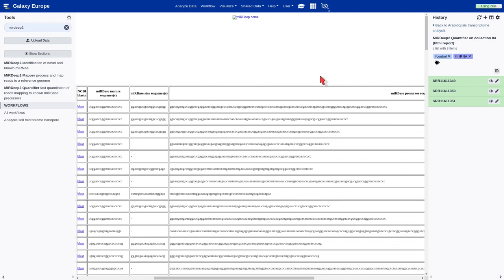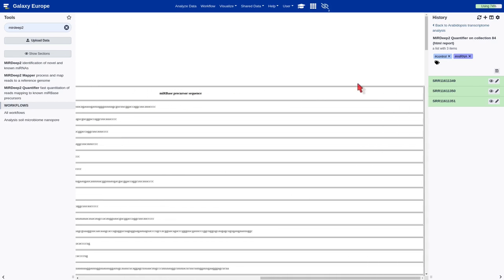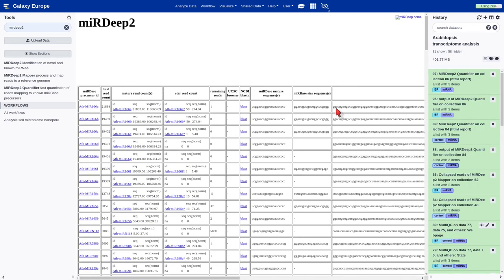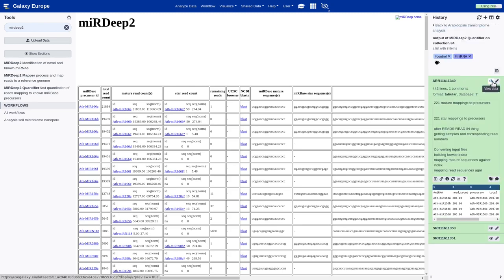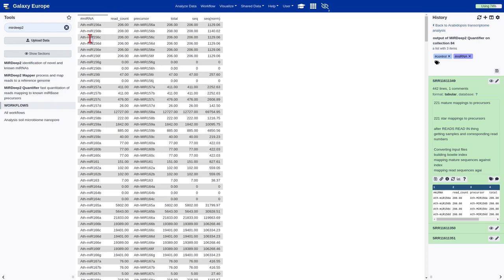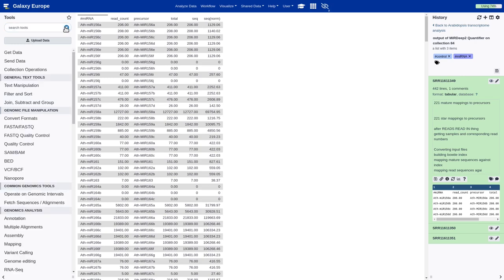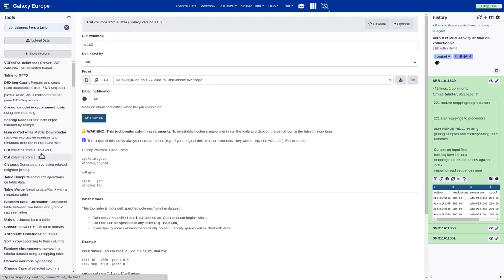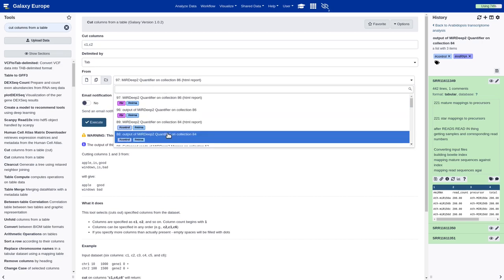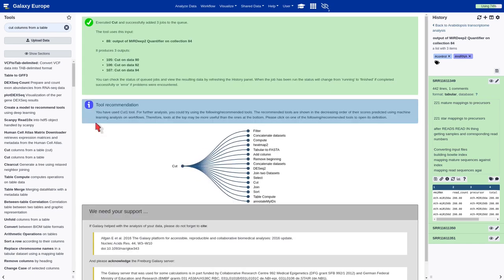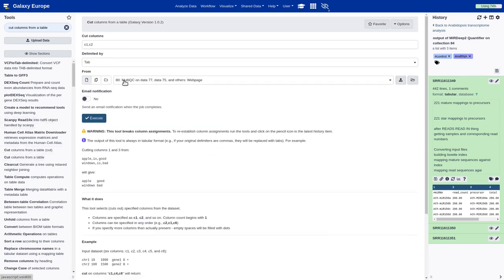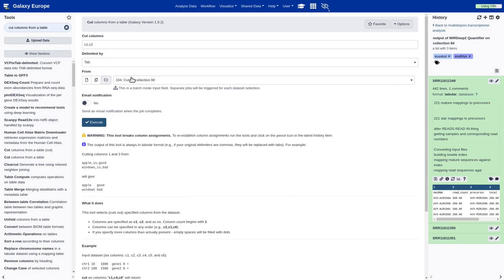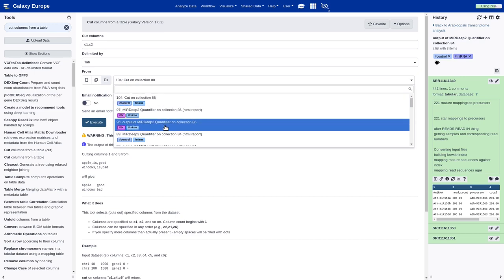Before performing the differential expression analysis, it is necessary to extract the first two columns from the quantification files. Those columns include information about the microRNA identifier and the read counts. Then, we should select the tool Cut Columns from a Table and select the first two columns, select the collection, the control sequence, and execute. And we should repeat the process with the brassinosteroid treated collection, and execute.